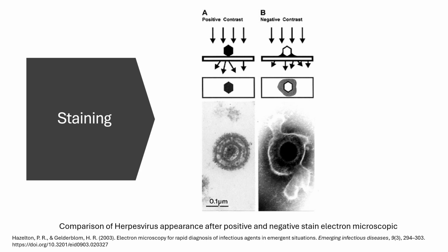Most biological materials show little contrast with their surroundings unless they are stained. In the case of light microscopy, contrast can be enhanced by using colorful stains which selectively absorb certain wavelengths. The electrons in the electron microscope are absorbed very little by biological material, and contrast is obtained mainly by electron scattering.